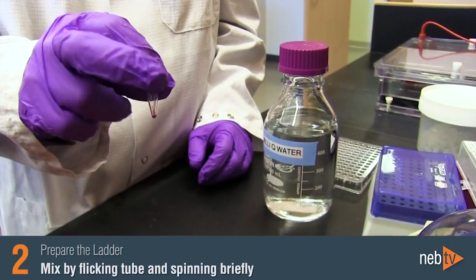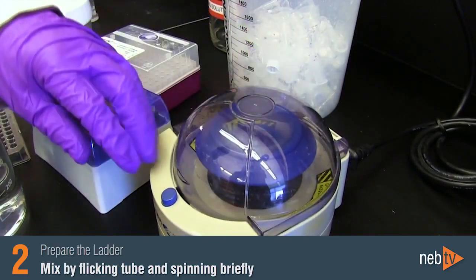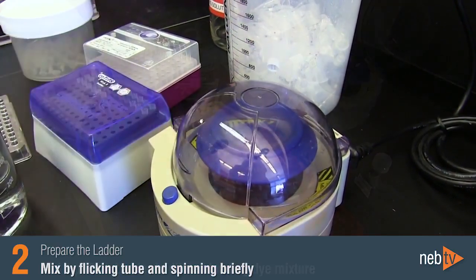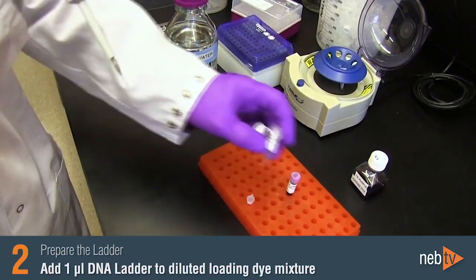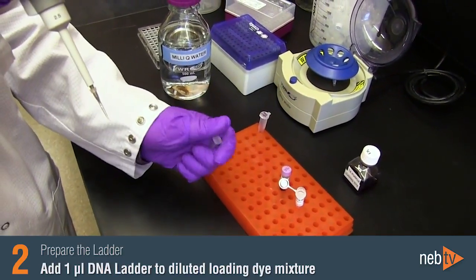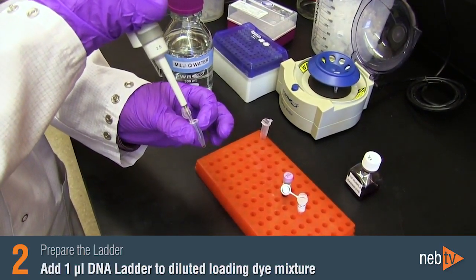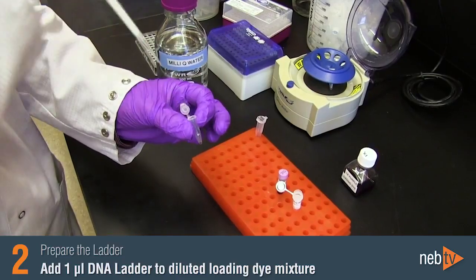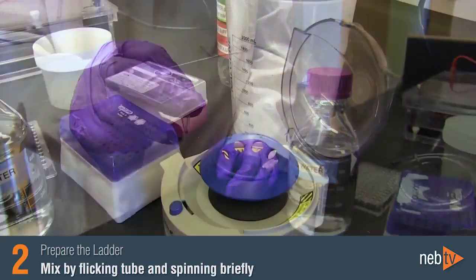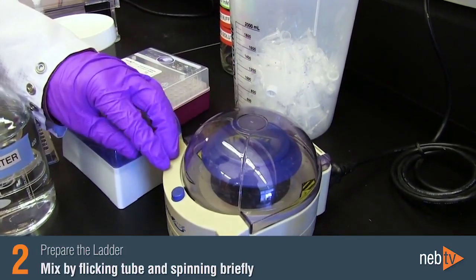Mix by flicking the tube and spinning briefly. Then add 1 microliter of the DNA ladder to the diluted loading dye mixture. Mix again by flicking the tube and spinning briefly to gather the prepared ladder at the bottom of the tube.